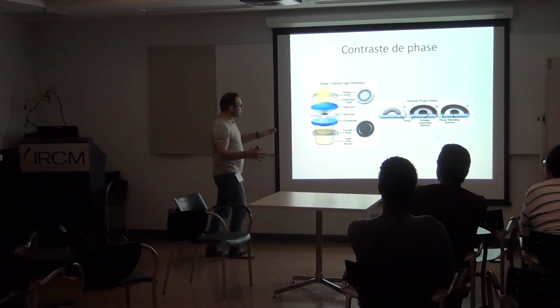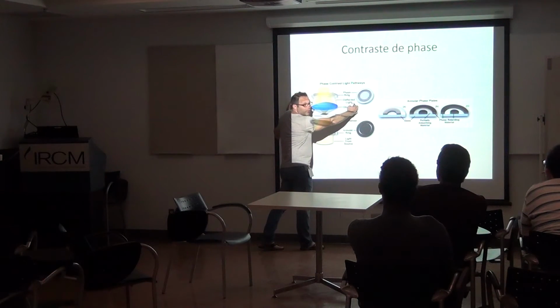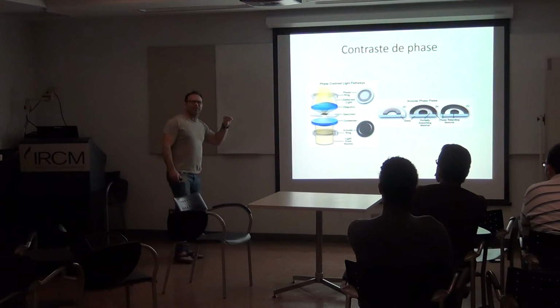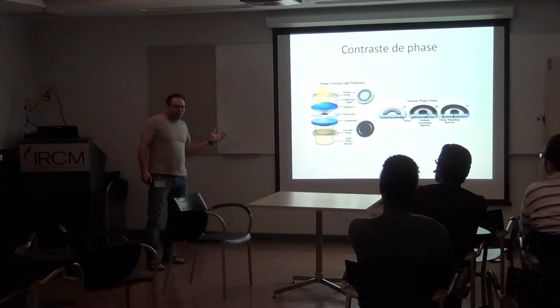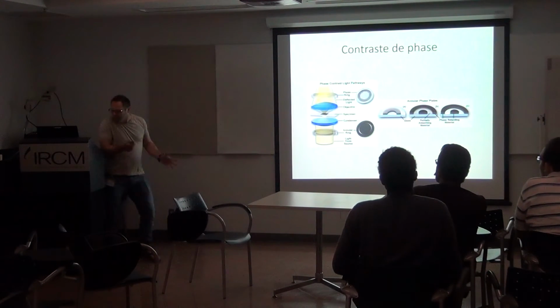And this is only because some objectives have a high numerical aperture, while others have a low or really low numerical aperture. So pH 1, you're going to see mostly with a 10x objective. A phase objective 5 is rare. It starts at about 10. And a really high one, let's say a 63x magnification objective, would be with the pH 3, but it's also rare.